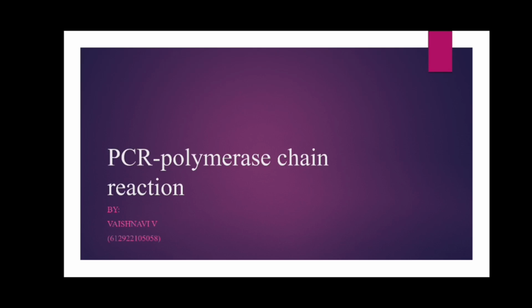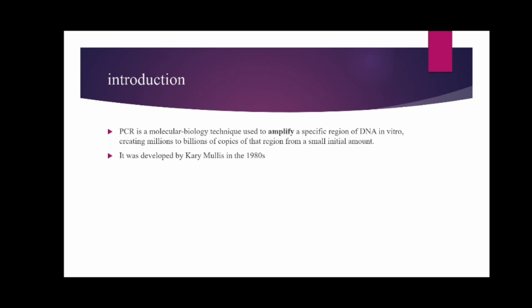In this PPT, I am going to talk about PCR, polymerase chain reaction. Introduction: PCR is a molecular biology technique used to amplify DNA at a specific region, and it is also used to create millions to billions of copies. It was first developed by Kary Mullis.